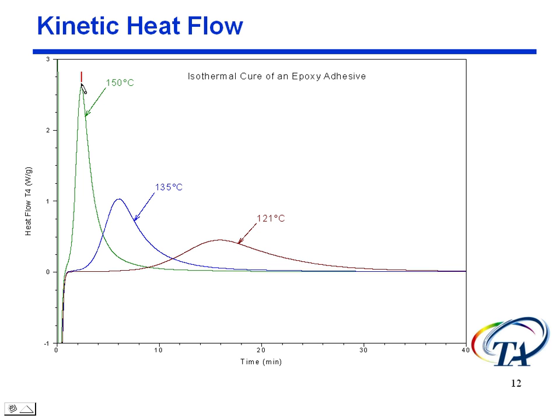So dropping the temperature even further spreads it out even further. So it's the heat flow value. If we wanted to look at a heat flow value here, it would depend on what temperature we're at, but it would also depend on what time we're at.